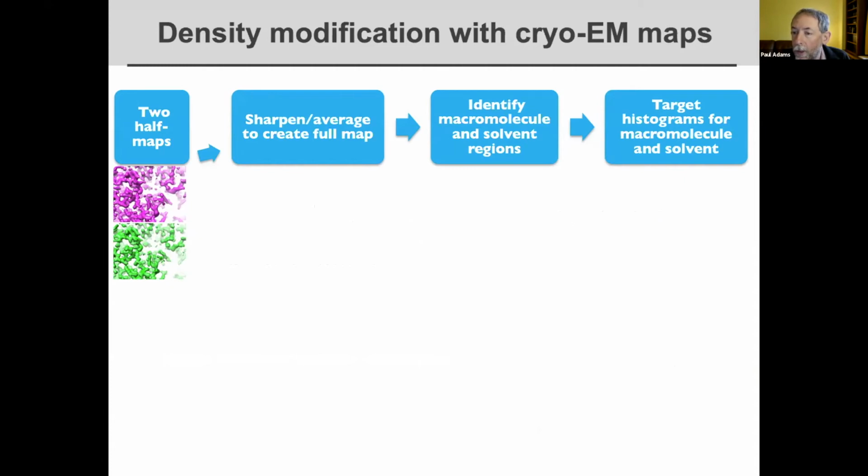One question, though, the latest one, is about whether filtered half maps would be a problem for density modification. Yeah, it depends on exactly what you do in this filtering of half maps. If the half maps are filtered in any way that masks out the solvent relative to the protein, that would definitely negatively affect density modification. If the half maps are filtered with default RELION characteristics, it works pretty okay. But in our experience, the very best maps for density modification are the ones that are the least filtered. And you can tell that because the solvent looks noisiest.